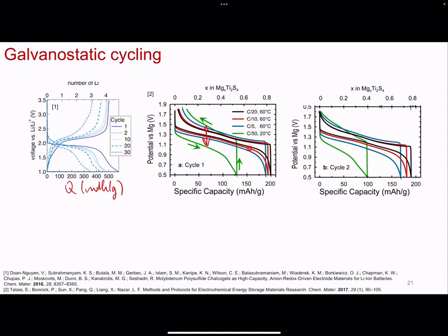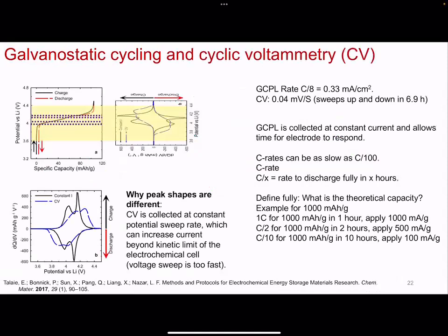This is at different C rates, either at elevated temperature or close to room temperature. So you could see, C over 50, but at room temperature, you don't get as much capacity out as at faster rates, but at elevated temperatures, right? So it's pretty useful either way to have either representation in this case.